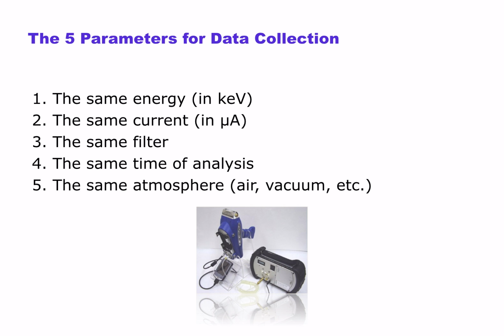A sample measured on Earth, where the atmosphere is primarily nitrogen and oxygen, will give a different spectra than a sample measured on Venus, which is about 95% carbon dioxide. This is because the density of the air itself is going to change the ease at which you see that spectrum. All these 5 parameters affect the source of light.